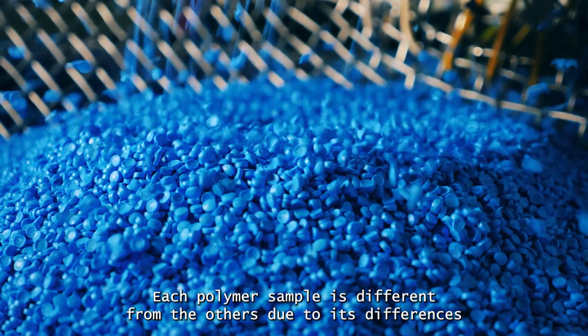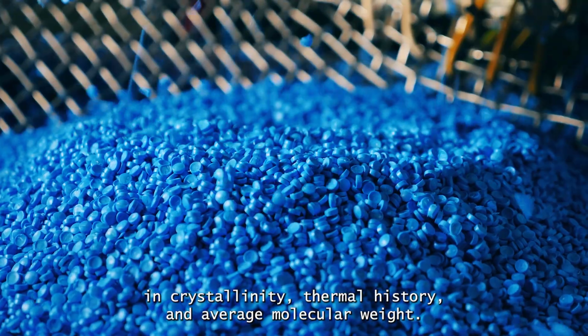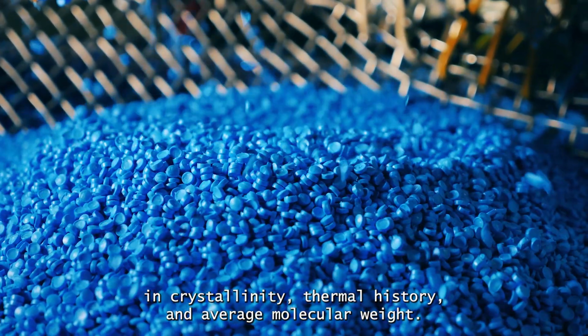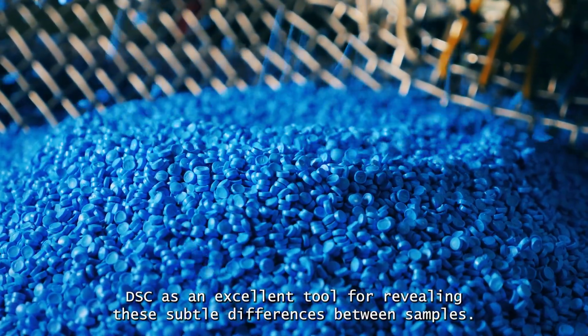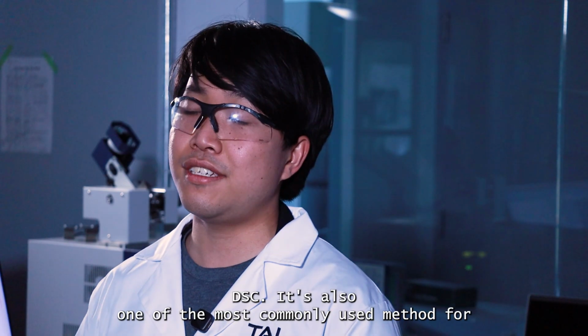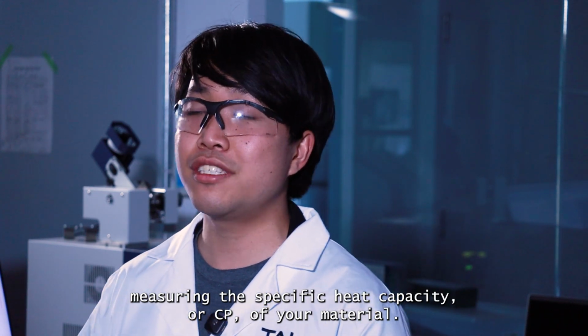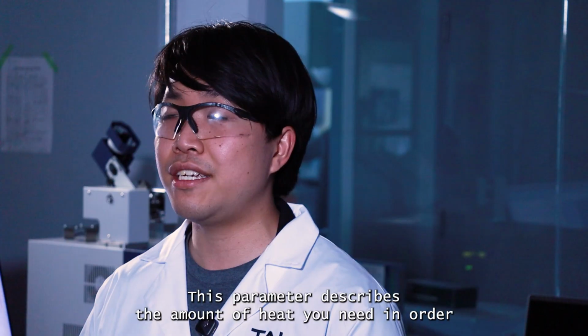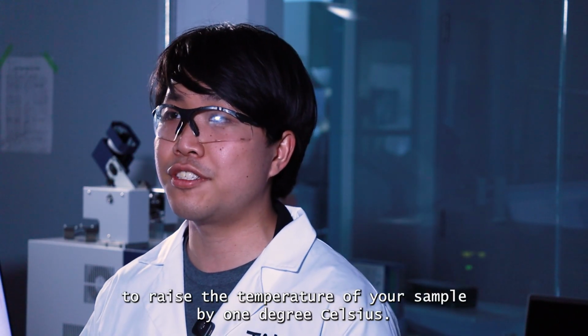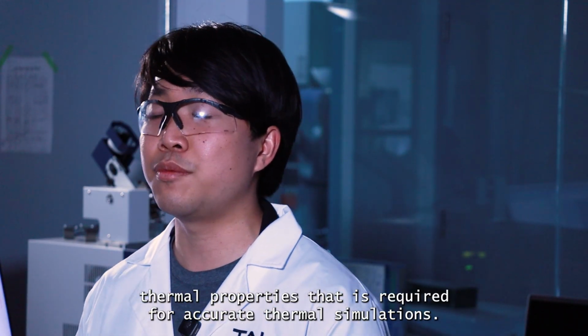Each polymer sample is different from the others due to its differences in crystallinity, thermal history, and average molecular weight. DSC is an excellent tool for revealing these subtle differences between samples. DSC is also one of the most commonly used methods for measuring the specific heat capacity, or CP, of your material. This parameter describes the amount of heat you need in order to raise the temperature of your sample by 1 degree Celsius. It is one of the most fundamental thermal properties that is required for accurate thermal simulations.